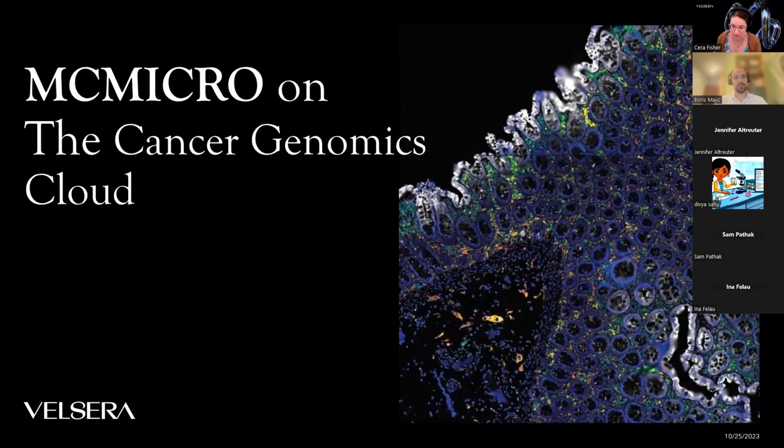I'm really excited to share this information about this tool with you guys. I, like many biologists, love looking at beautiful fluorescent microscopy like this. But the work that goes into actually analyzing these whole tissue, whole slide imaging files is a lot more than many of us, I think, appreciate. So what is MCMICRO and how does it help us understand what we're seeing in these gorgeous slides?